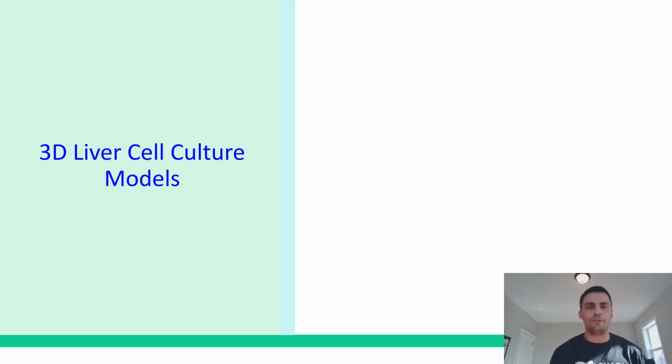The next one I'll dive into is 3D cell culture. Now, 3D cell culture has evolved dramatically. 5-6 years ago, when we were at conferences, Society of Toxicology and SLAS, this was primarily a lot of academic researchers. And then really rapidly, every pharma company, every biotech company started to rapidly adopt 3D cell culture, initially as spheroids, and then as organoids, and now looking at much more complicated systems.